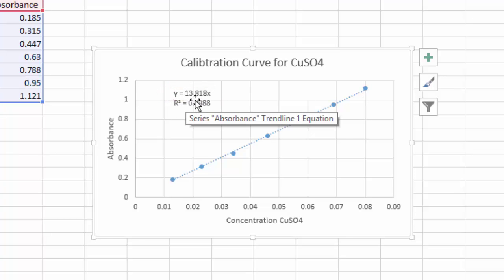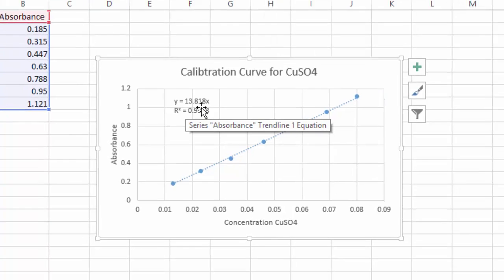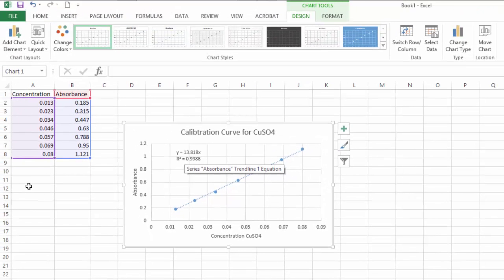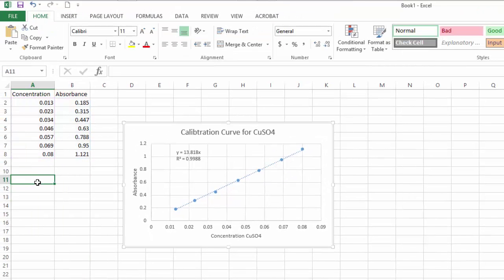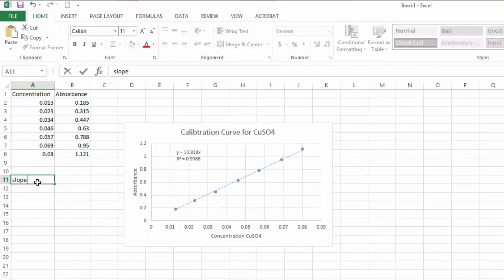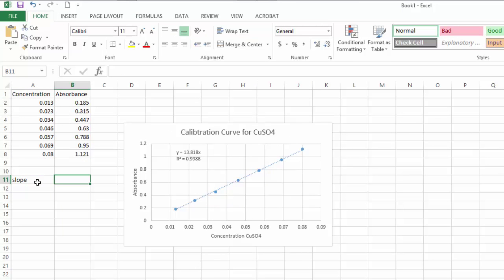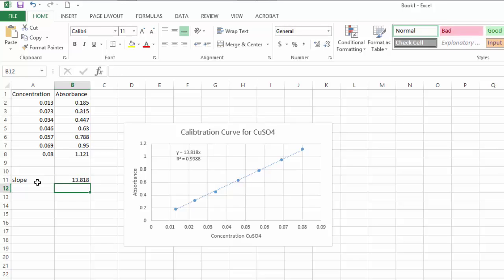I need this equation: y = 13.818x. That 13.818 is going to be my slope of the line. I'll label a cell 'Slope' and put in 13.818.